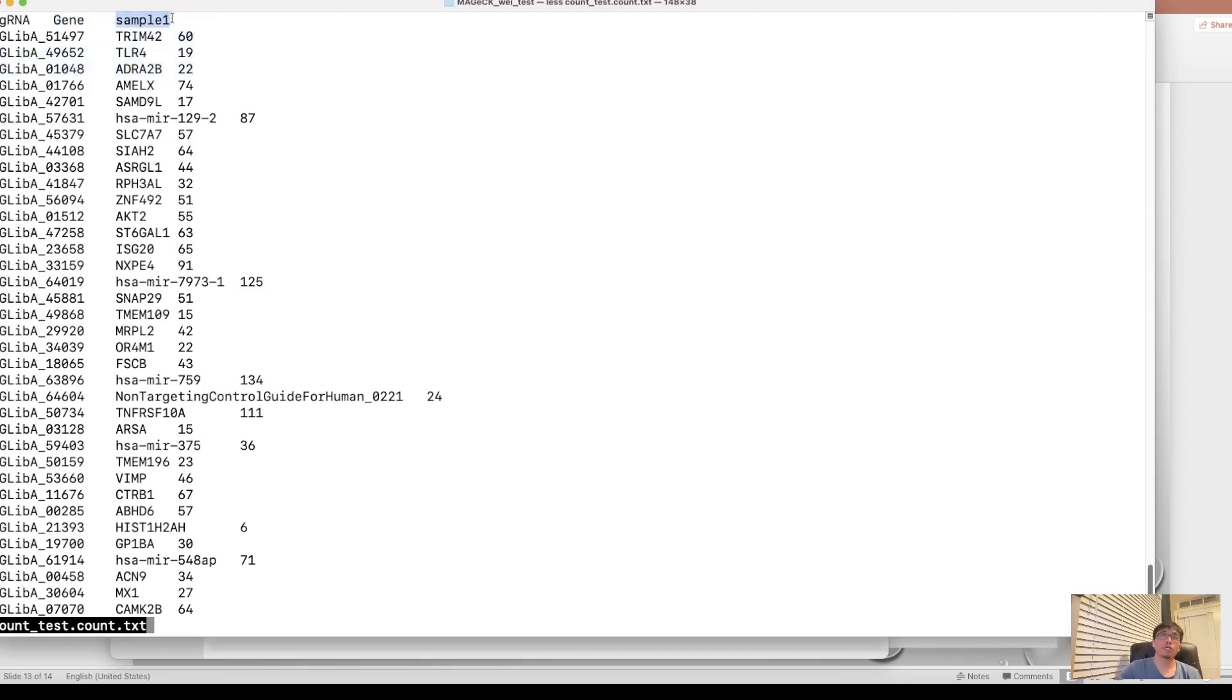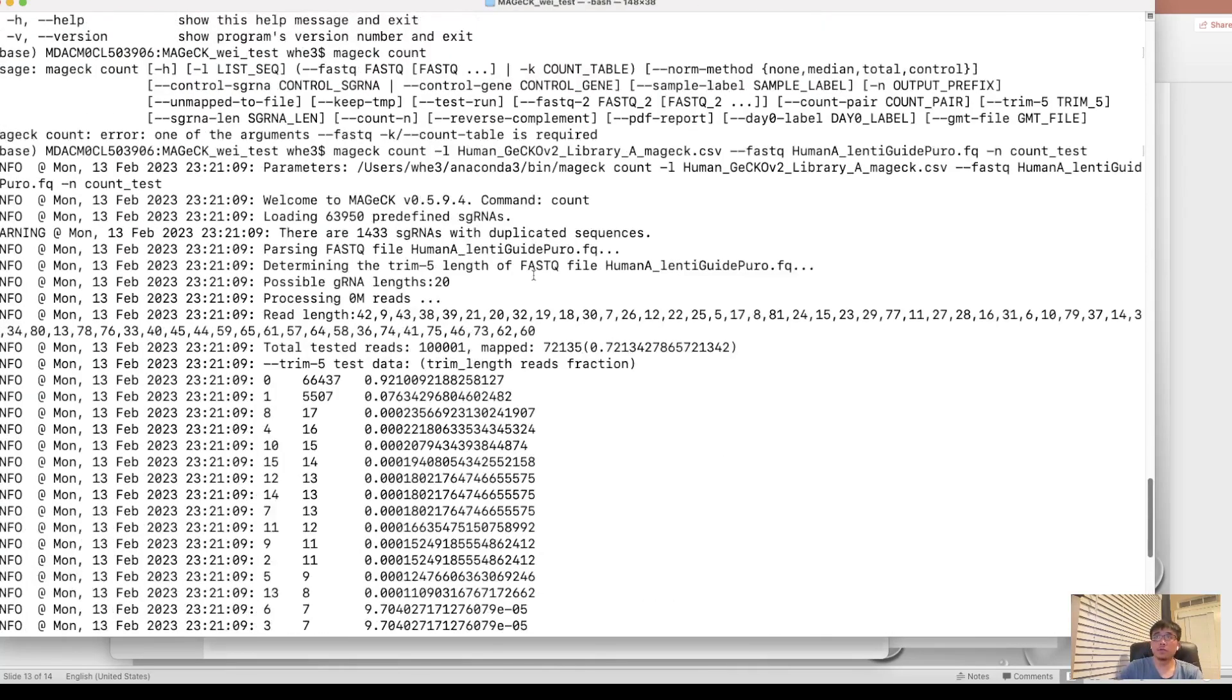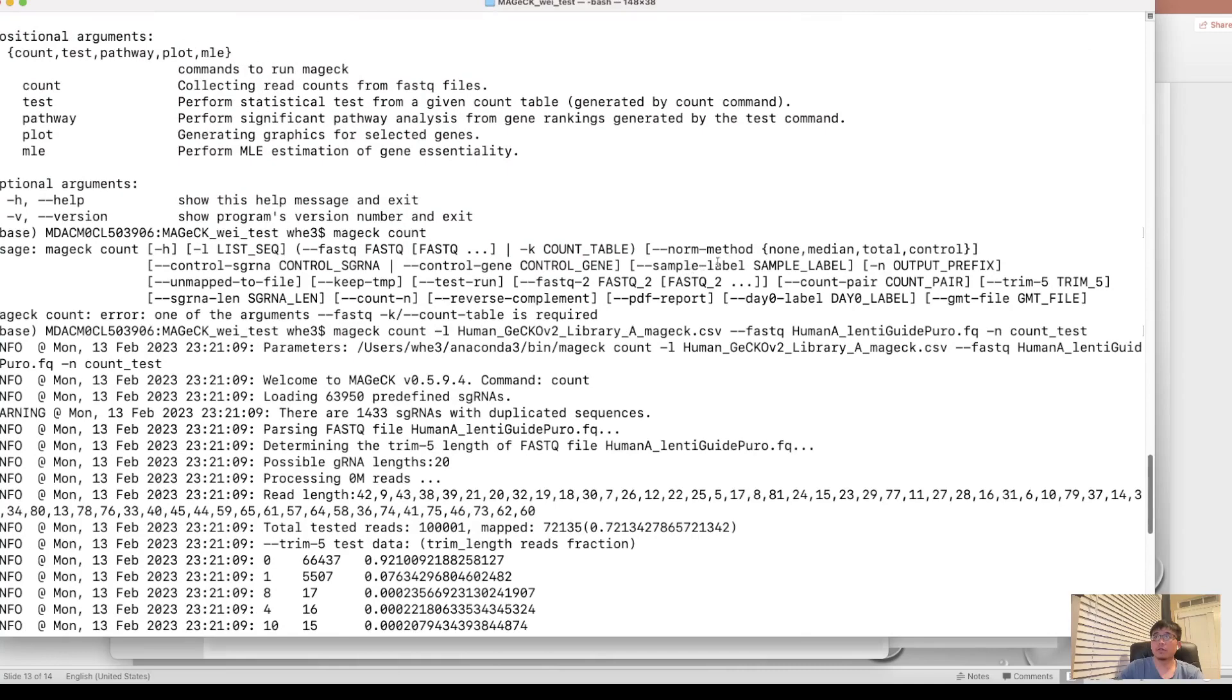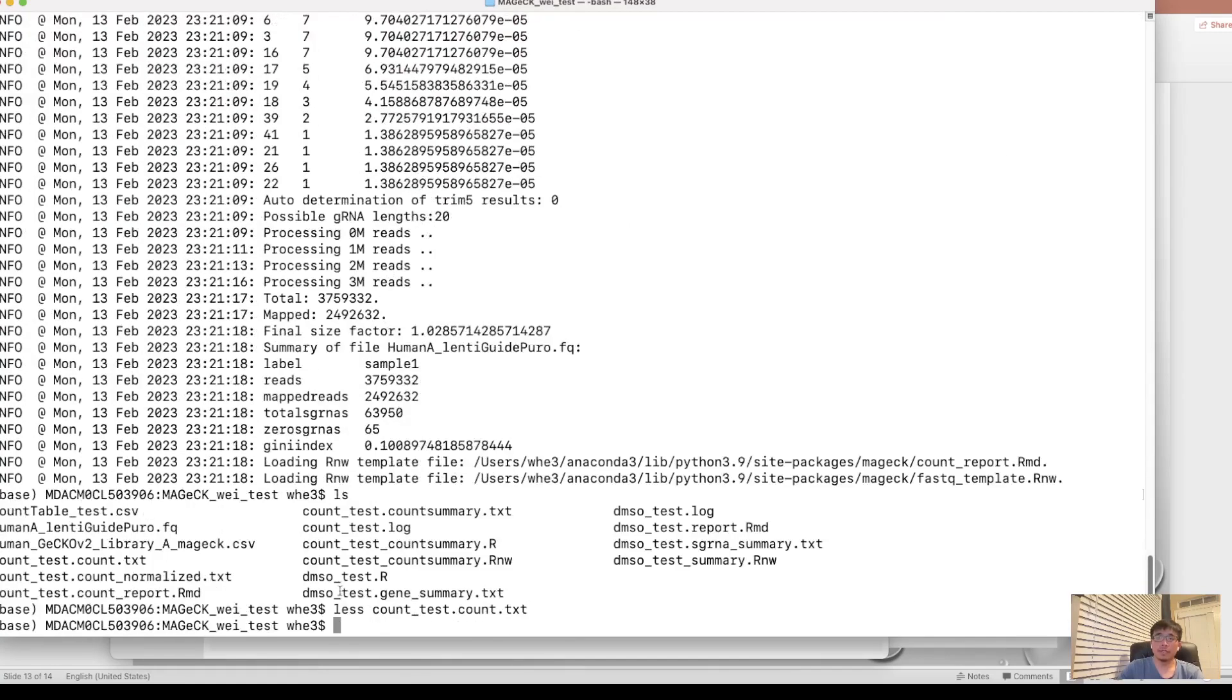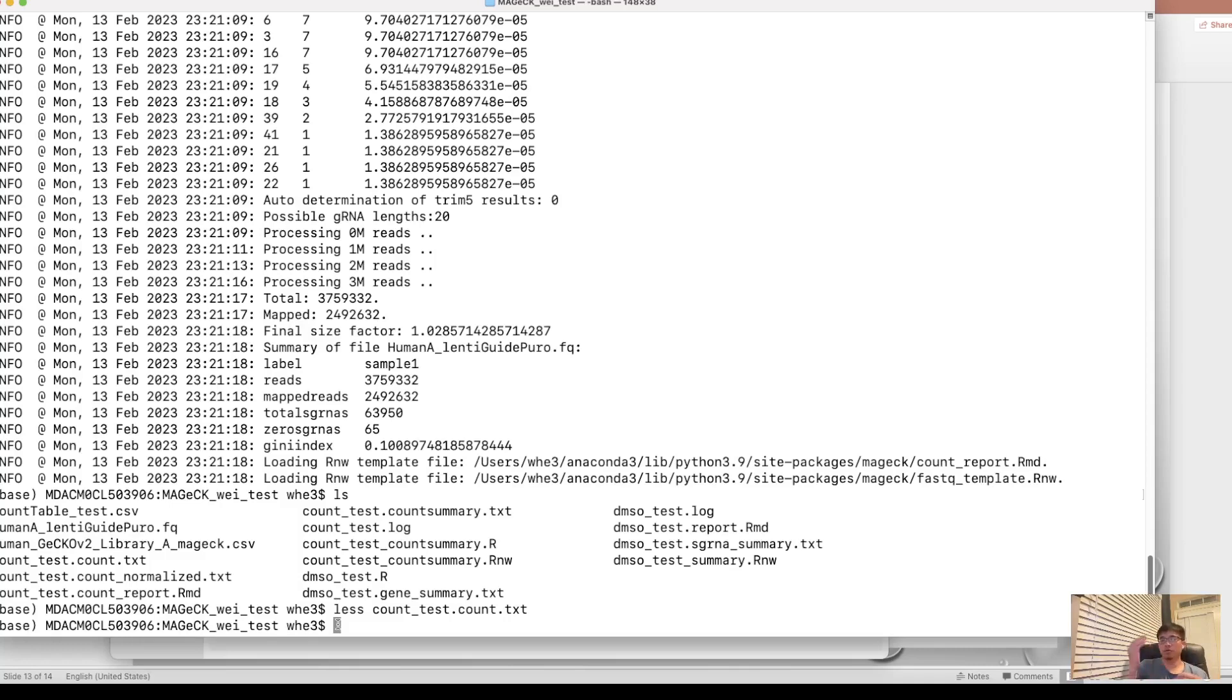And the sample1 is the default name of this column. And you can also set by yourself using the parameter sample label. And then with this read count table, we can do the test whether under certain condition, the read count under certain condition, has a positive selection or negative selection compared to the D0 or the plasmid as a control.